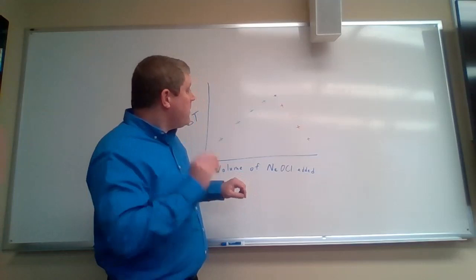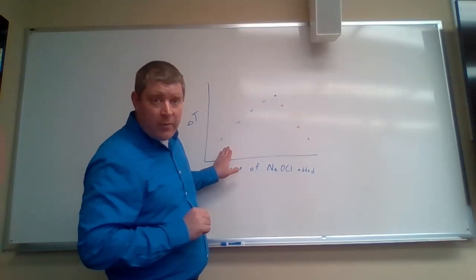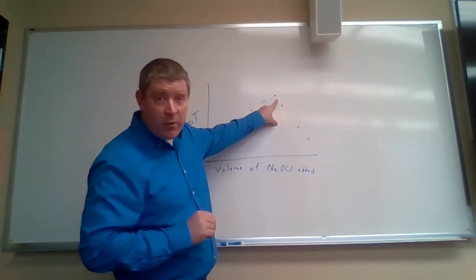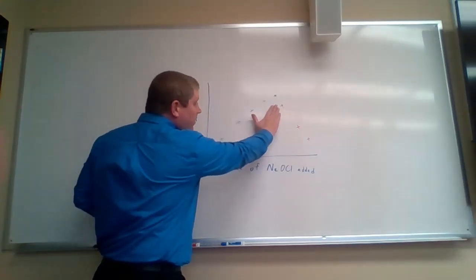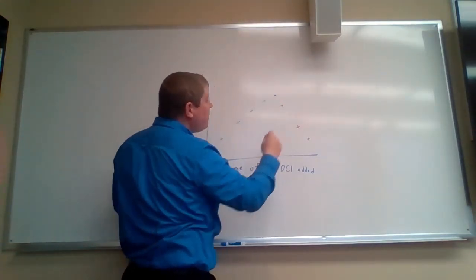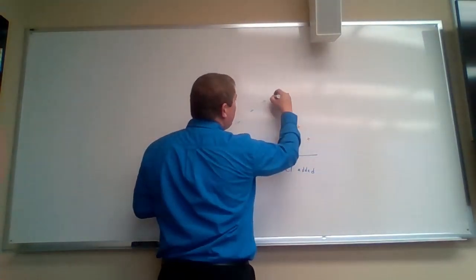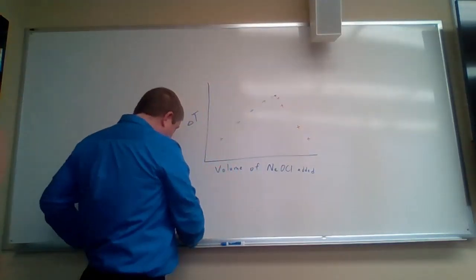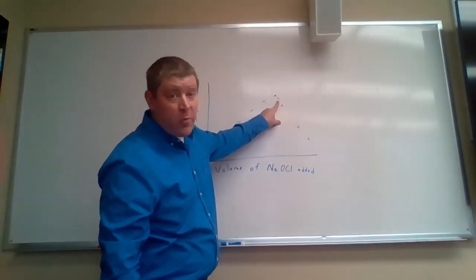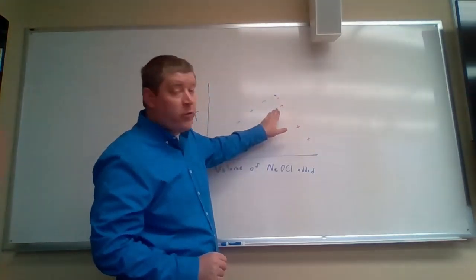Now, in reality, the procedure tells you to collect at least 4 data points on each set. My recommendation is to collect a data point that's fairly close to that maximum value. So I've shown it here with a fairly sizable spread between the maximum value and the two that are closest to it. But in reality, you'd probably want to get fairly close to it with your other values so that you have as much data as possible. You definitely want to include those close data points, but not the maximum, in your calculations for those trend lines.